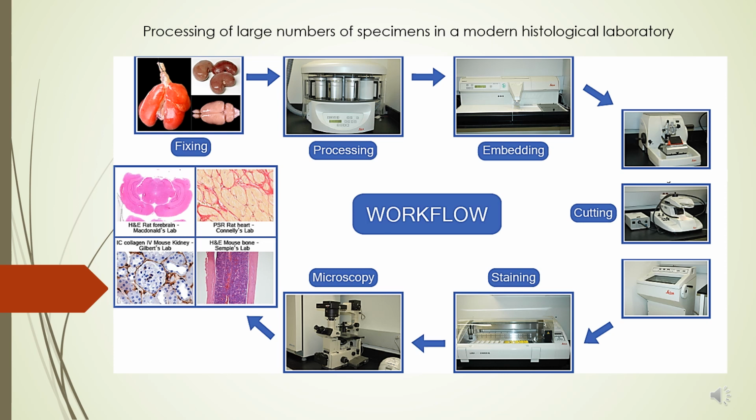The quality of the final diagnosis is largely determined by the accuracy and quality of the previous stages, so equipping the laboratory with modern technical means is one of the main factors determining the final result of the study. The following video demonstrates how the main stages of histological sample processing, previously studied by us manually, are implemented on a modern histological conveyor.